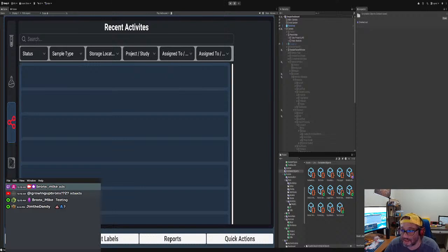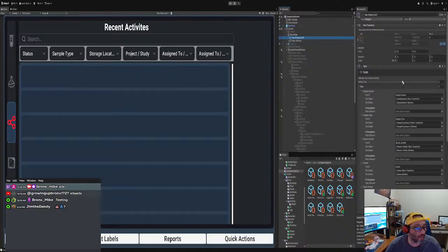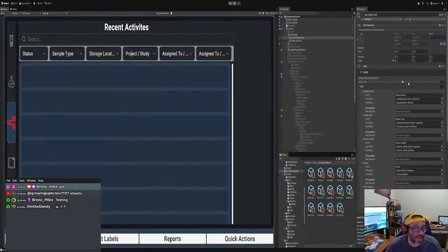Oh, the recent activity panel. Okay, the same thing. All right, but this time, go here, panel button. Okay, this time we are in recent activities. All right, I'm gonna take a break real quick. Give me like 2 minutes for a bathroom break, and I'll be right back.